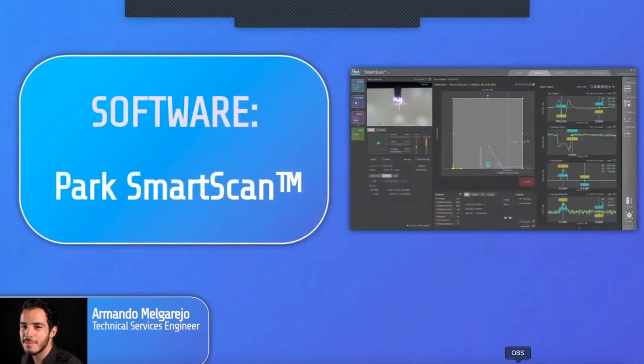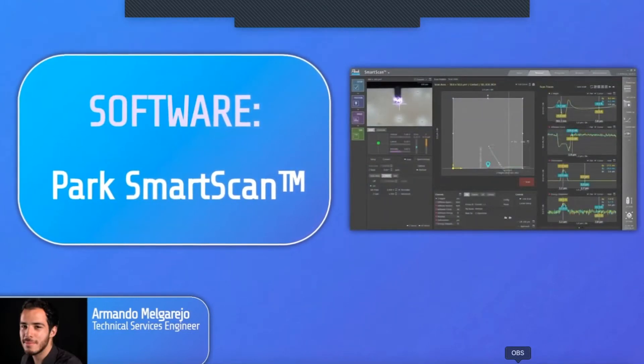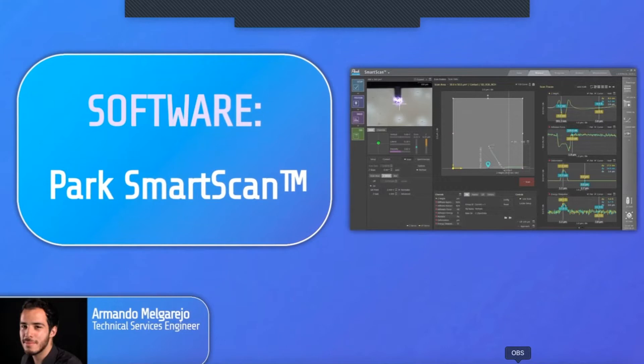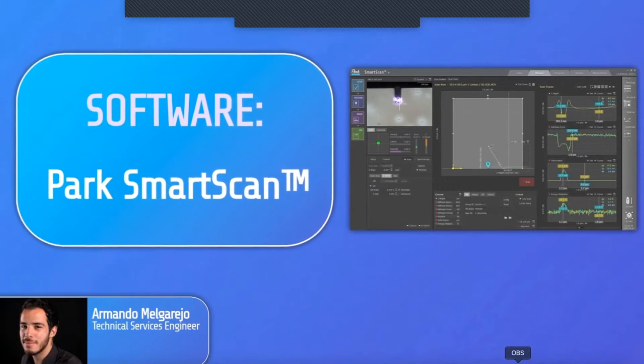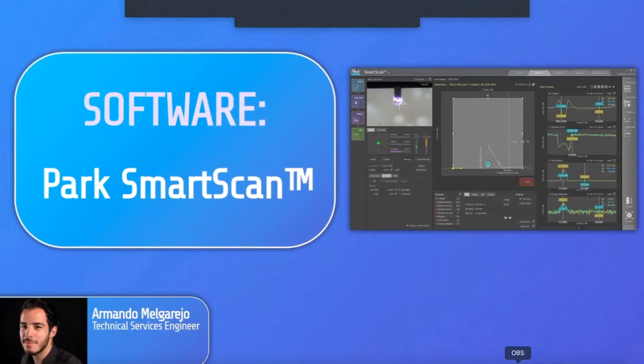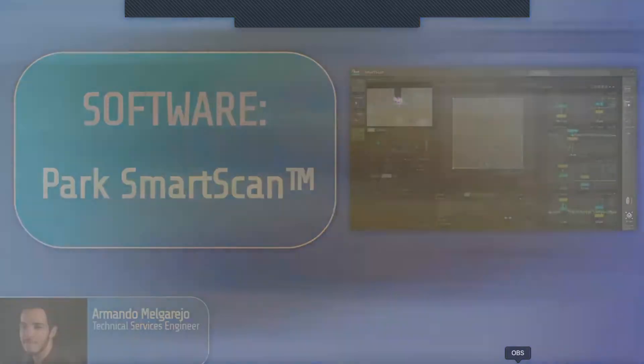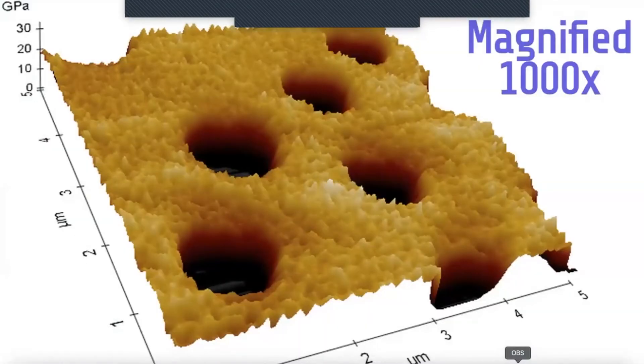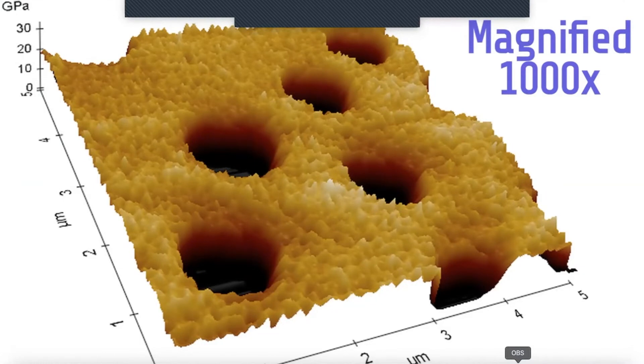The operating software on this AFM is called Park SmartScan. It incorporates many automatic features, which makes it the easiest to use AFM system on the market. With Park SmartScan, even novices can obtain high-quality AFM images with the push of just three buttons.